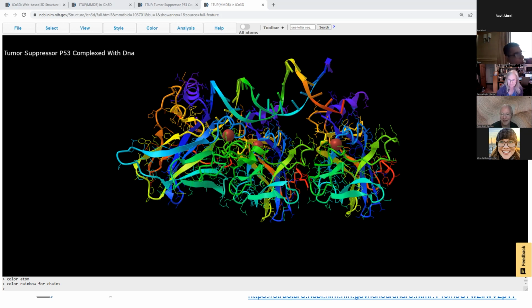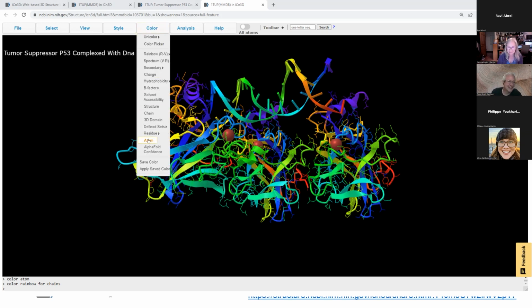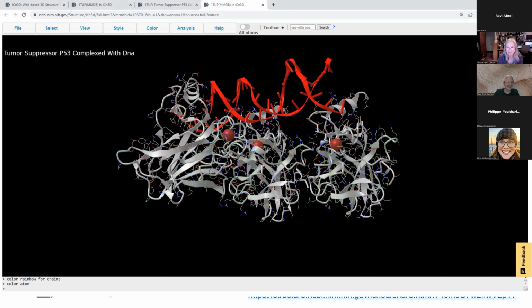Jai, I was smiling because we've had this debate. By the way, we should lump together spectrum and rainbow and just have a toggle so that people can go from magenta to red or red to magenta the way they want. Right now, we have discussions we should have. But I would answer also that we didn't model after PyMOL. We modeled after the rainbow, the seven colors. Sorry, I was cutting you off. And then it's a matter of following an order.